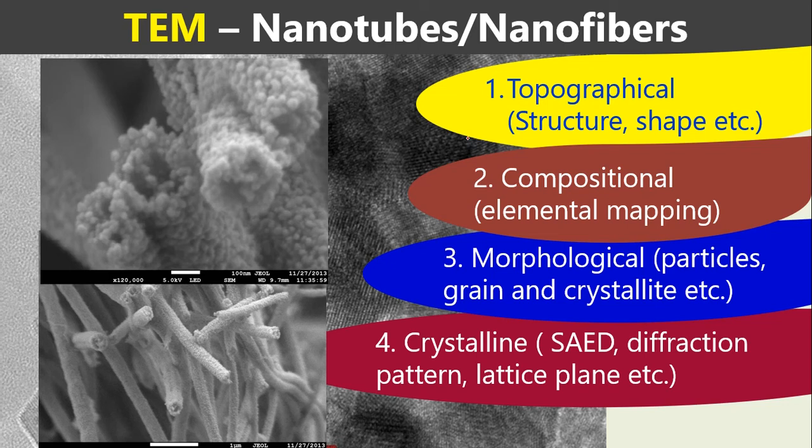Let's discuss transmission electron microscopy images of nanotubes or nanofibers. You can see the fibers are porous and hollow, so you can call them nanotubes or hollow nanofibers.